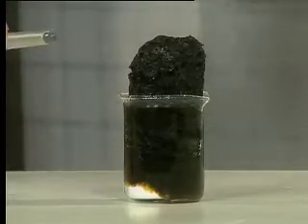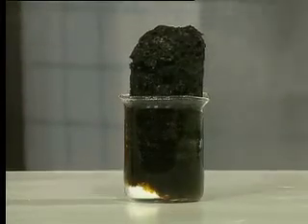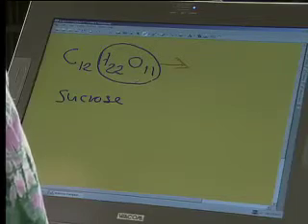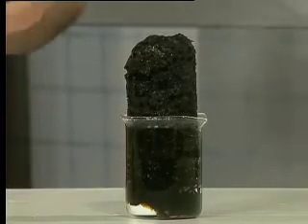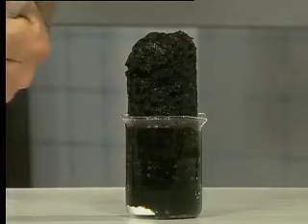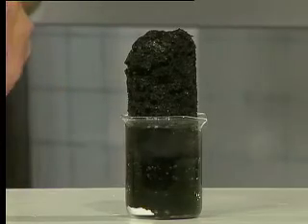Now, I hope you can see that this isn't white sugar anymore. We've extracted all the water out of the sugar and we're left with a solid lump of black carbon. This is a wonderful elimination reaction where we've extracted all the water out. There's some extra gas because I put in some excess sulfuric acid.